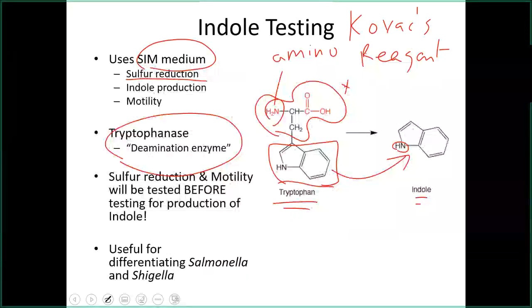In the form of, I think it's just elemental sulfur. There's also iron in here, small amounts of iron. And that typically just sits there. It's inert, unless organisms are reducing sulfur. So here's what happens in sulfur reduction. Here's sulfur. If it gets reduced, electrons and hydrogen ions are added to it, and it becomes H2S. So this is hydrogen sulfide.